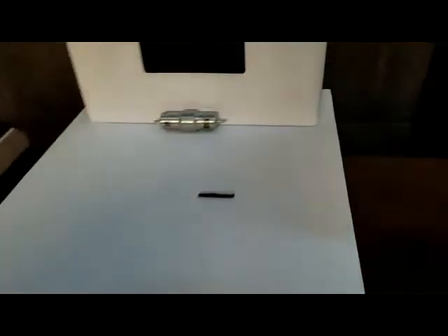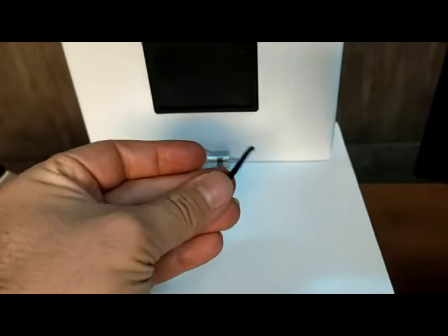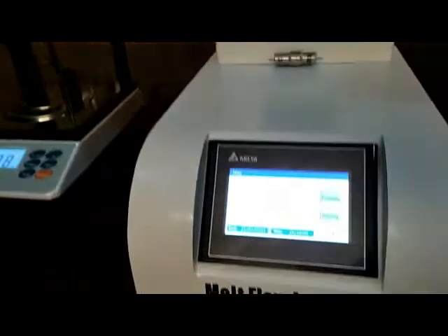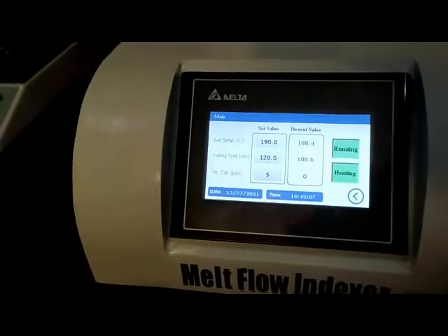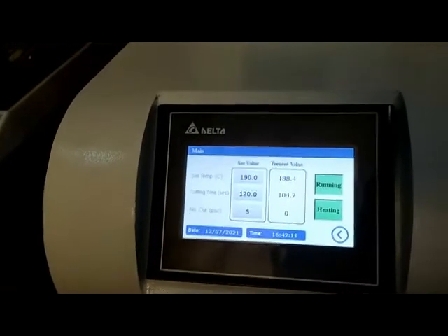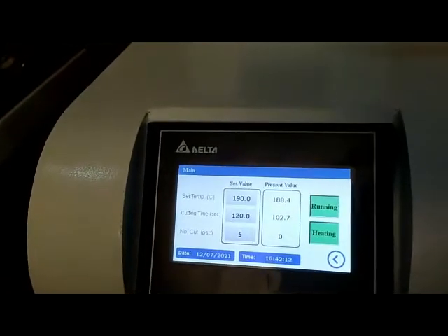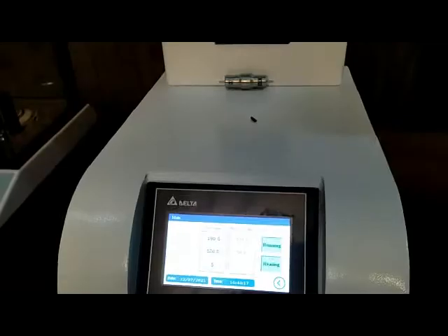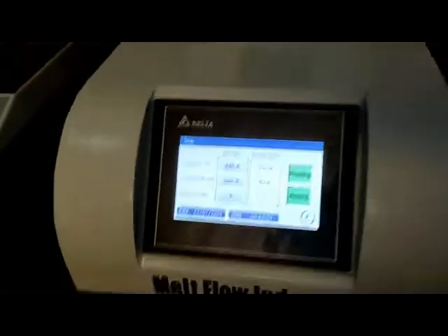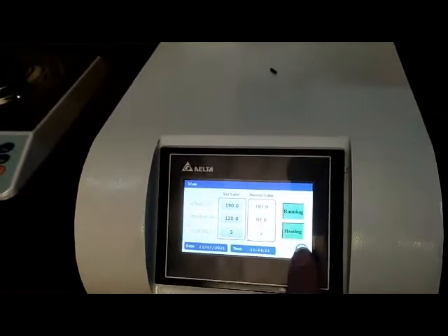The automatic cutter will be activated and cut the first sample. You must throw out the first sample and wait until the counter counts the seconds and automatically cuts the five specimens you want to test. In this time, while waiting for the test to be finished, let's see the other menus of the machine.